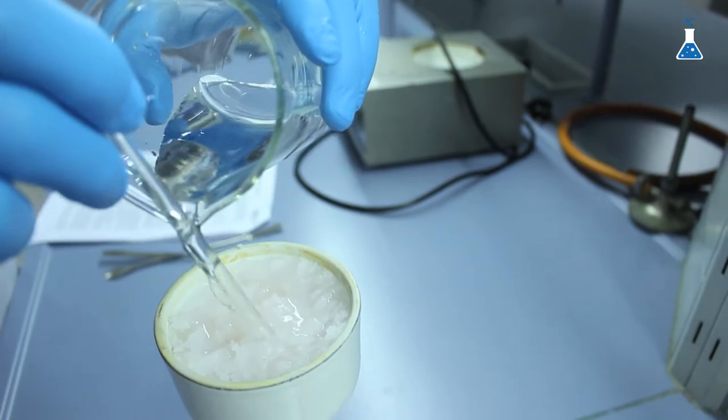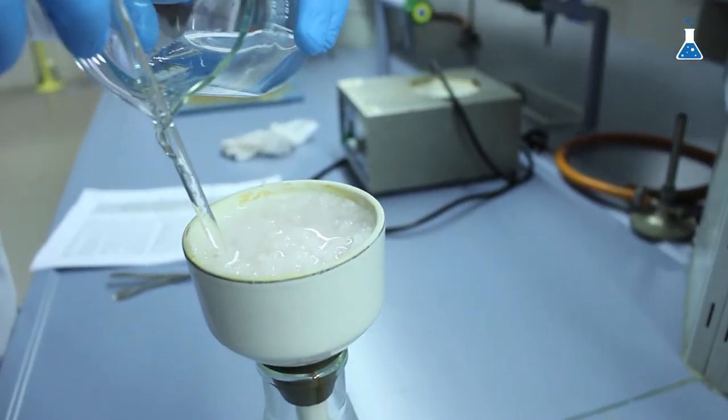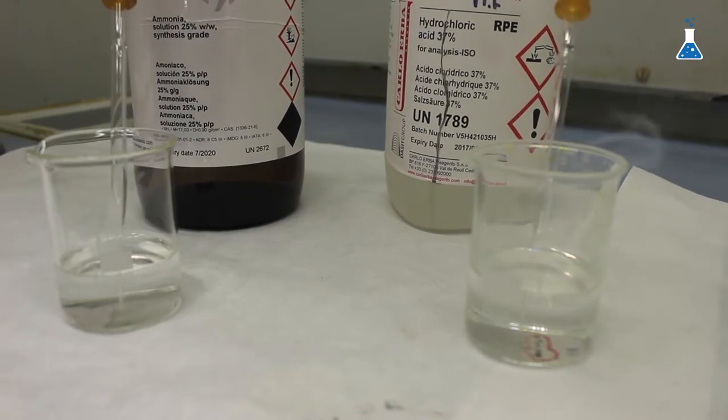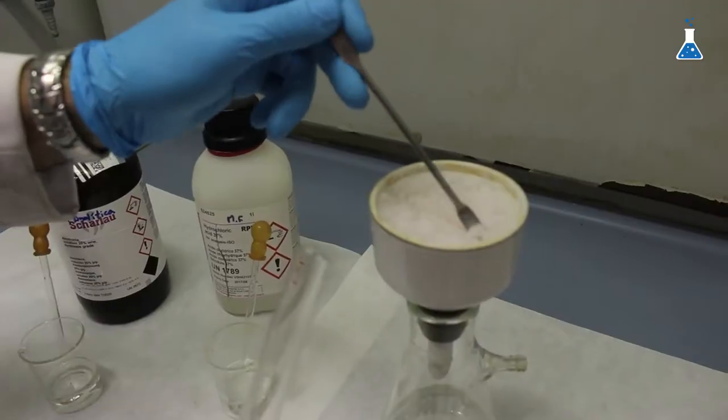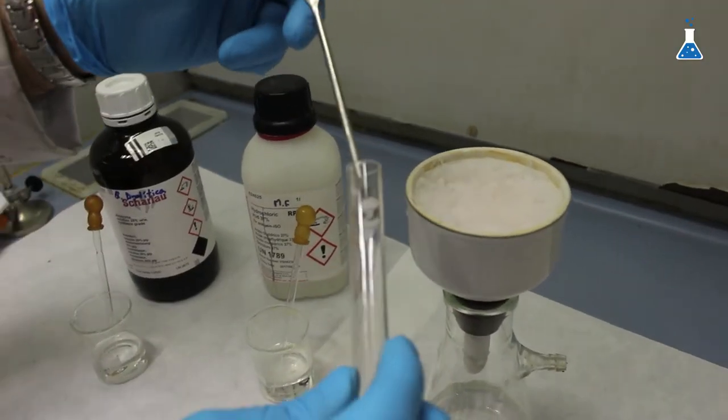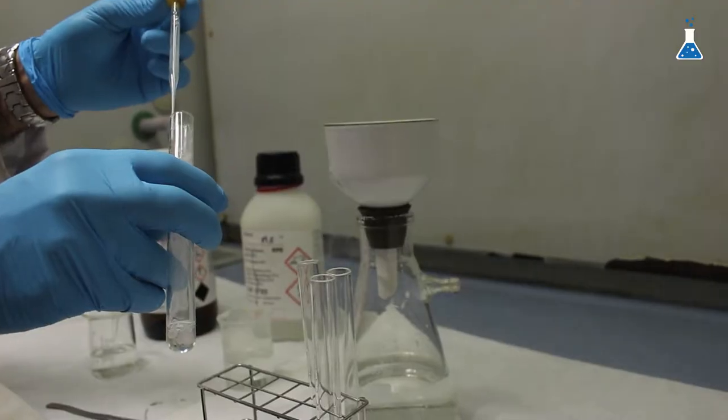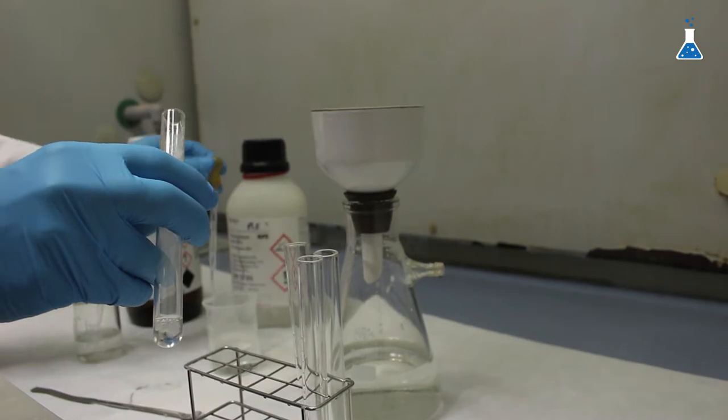The white solid is then washed with a small amount of water and we are going to test its amphoteric behavior. Let's put a tiny amount of the oxide in two different test tubes. And now we are going to check its reaction with acid and base.